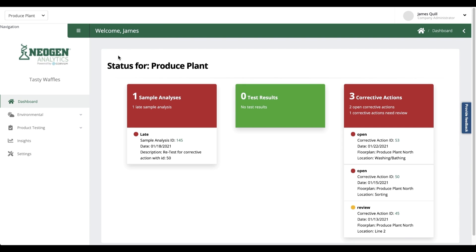Neogen Analytics is a game changer when it comes to automation. Let's talk about scheduling swabs as an example. So many of our customers have a generalized swabbing protocol.